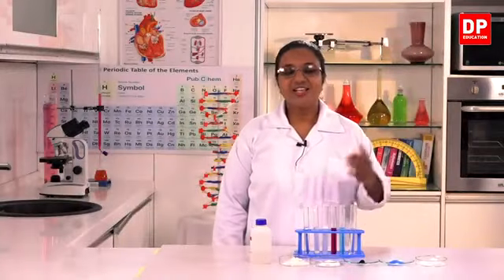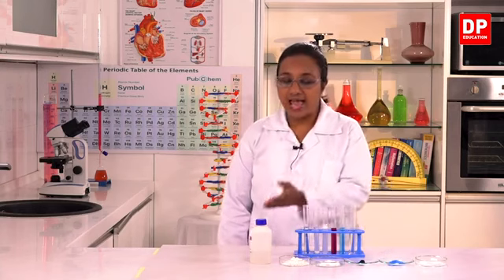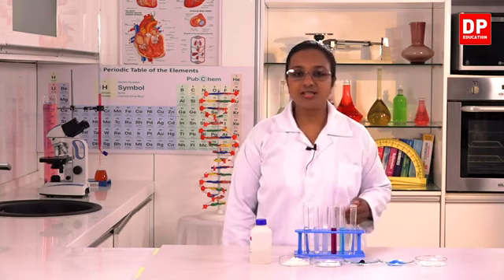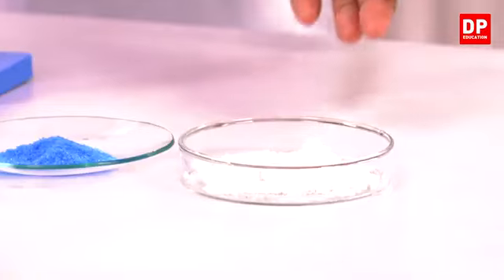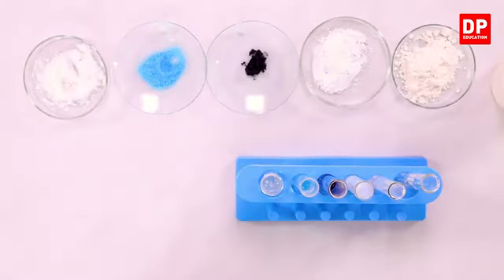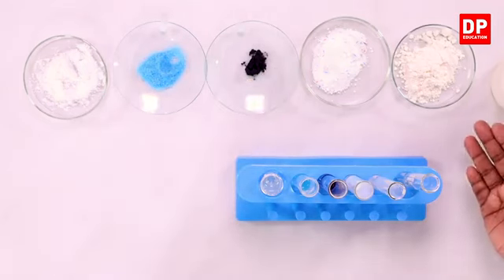Okay students, so today we are going to observe how different solids and a liquid dissolve in water. So, to do this activity, I have different substances here. The sodium chloride, that is the normal salt that we use at home. Copper sulfate solid, you can see here. Then potassium permanganate solid, washing powder, and here is wheat flour and also ethyl alcohol.